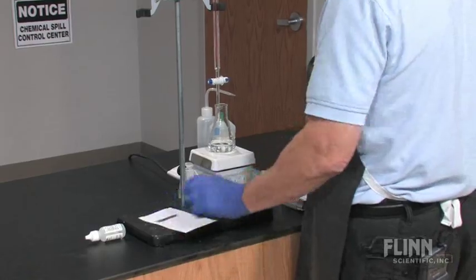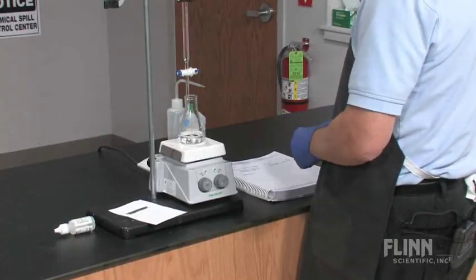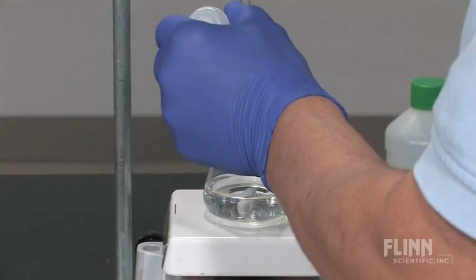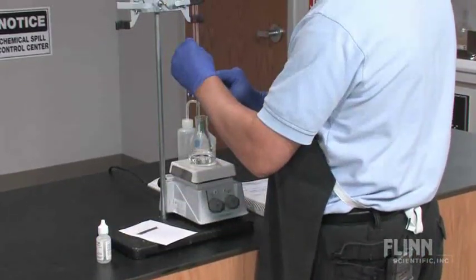Record the initial volume of the titrant. Estimate the amount of titrant needed, and then add several drops of indicator solution to the sample.